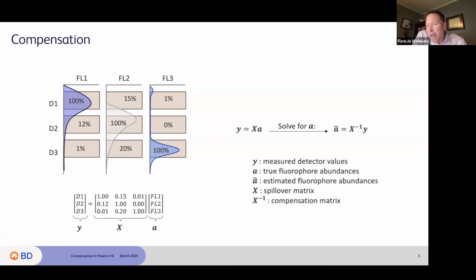And the biggest aspect of that to differentiate it from everything that's coming next is just that you have a specific detector that's associated with each one of your fluorochromes. You have, fingers crossed, designed your experiment well, designed your panel well to match the tool that you're measuring the data with, and you have a detector in the appropriate location where you get one of these peaks from each of the different fluors that you're using. So that's compensation.